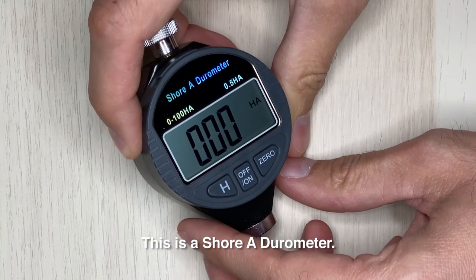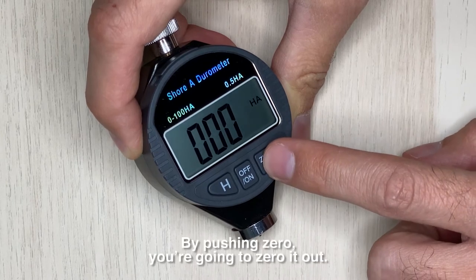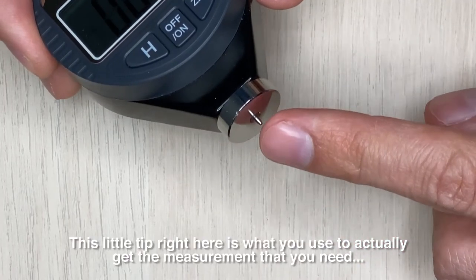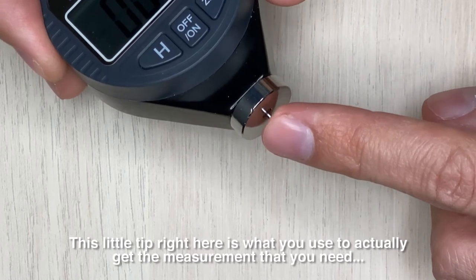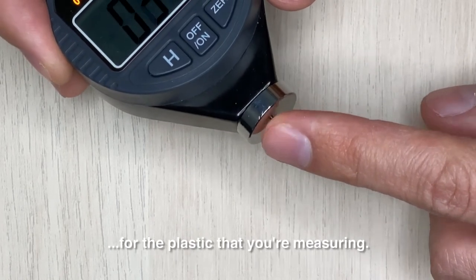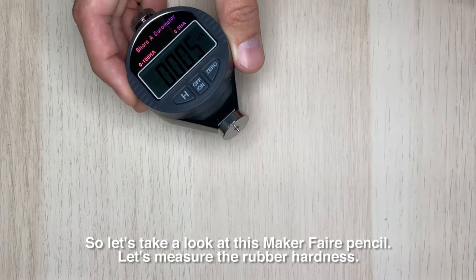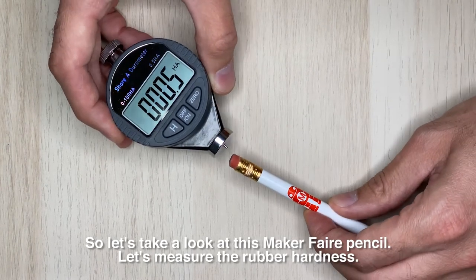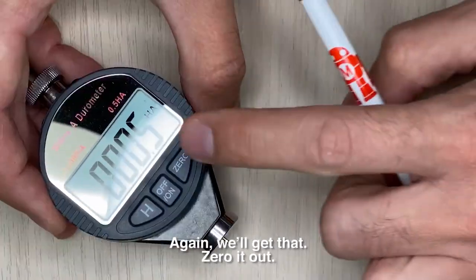This is a Shore A durometer. By pushing zero you're going to zero it out. This little tip right here is what you use to actually get the measurement that you need for the plastic that you're measuring. So let's take a look at this maker fair pencil — let's measure the rubber hardness.